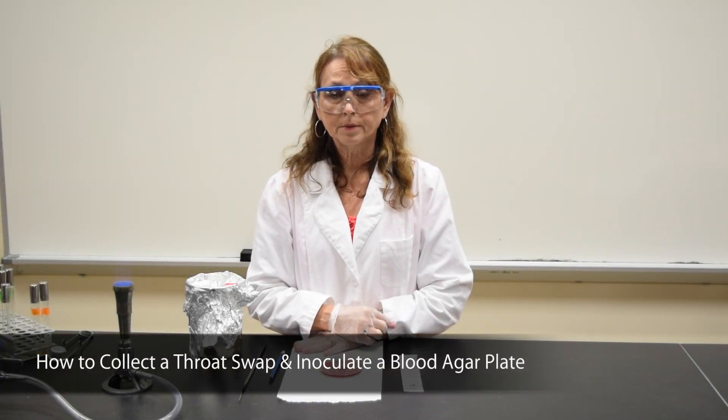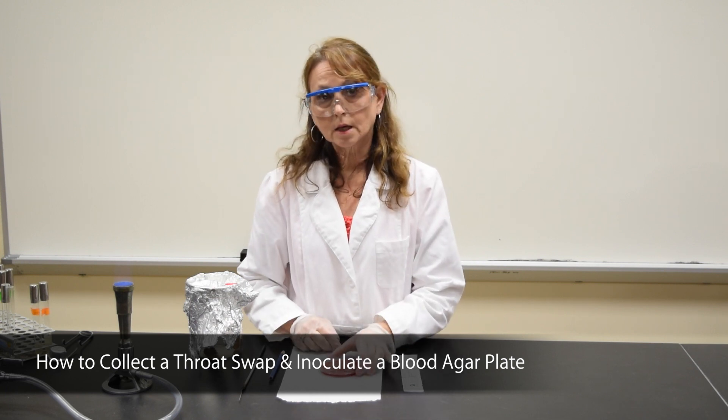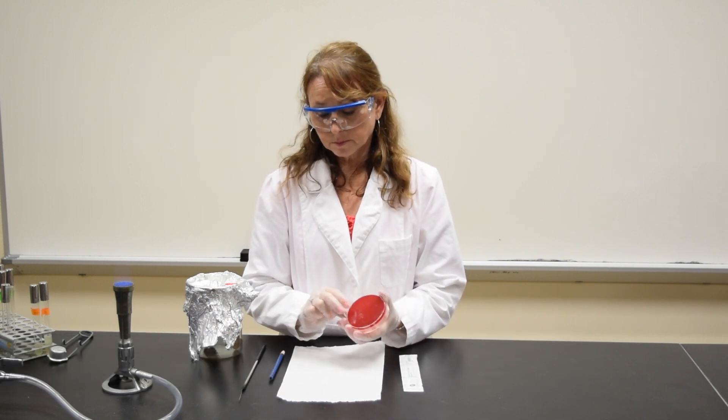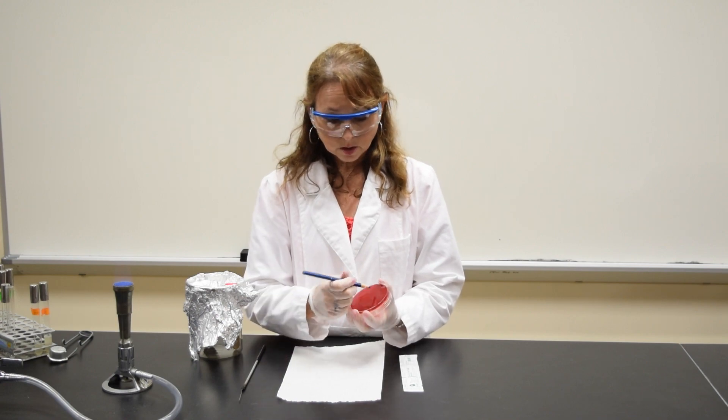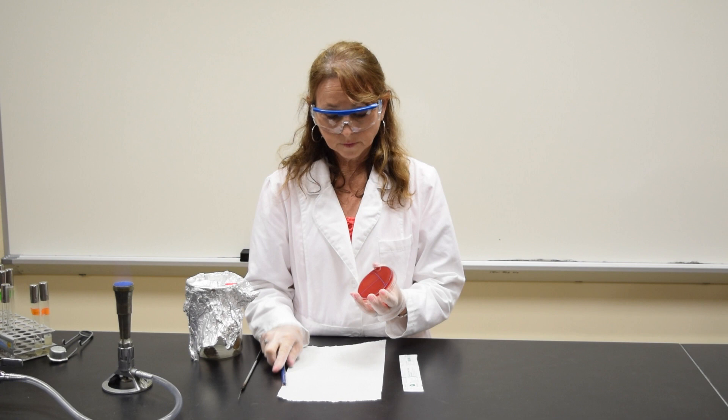This demonstration is to show you how to collect a throat swab and inoculate a blood agar plate. In order to inoculate a blood agar plate, you're going to be doing a T-streak. So take your wax marking pencil and make the letter T on the bottom of the plate.